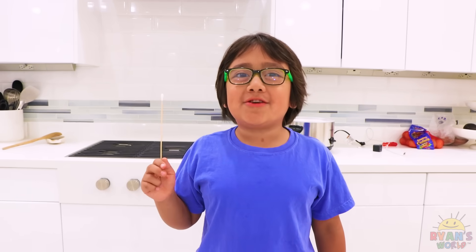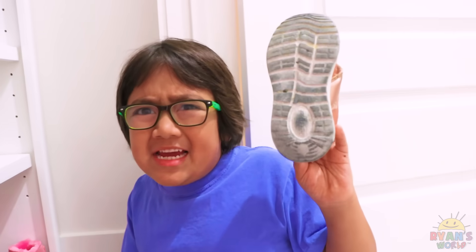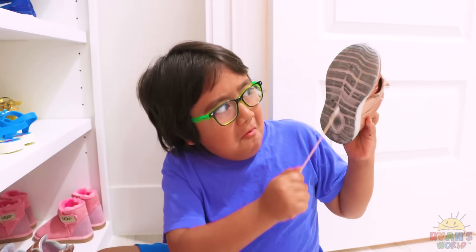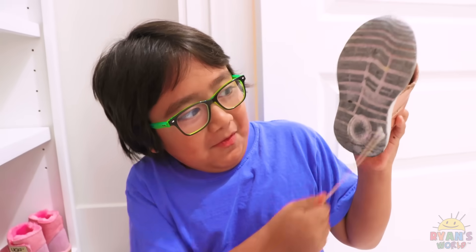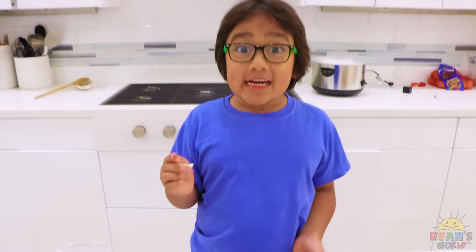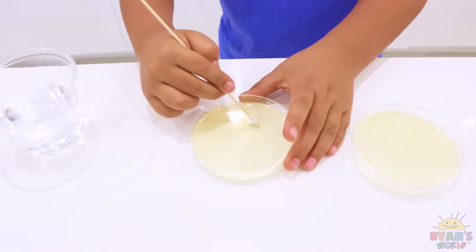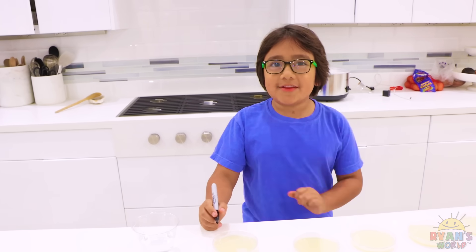First up, we're going to dip the swab in water. First swab, I'm going to test out my sister's shoe. These are our agar plates and I'm going to transfer the bacteria and see how it grows. Now I'm going to label it.